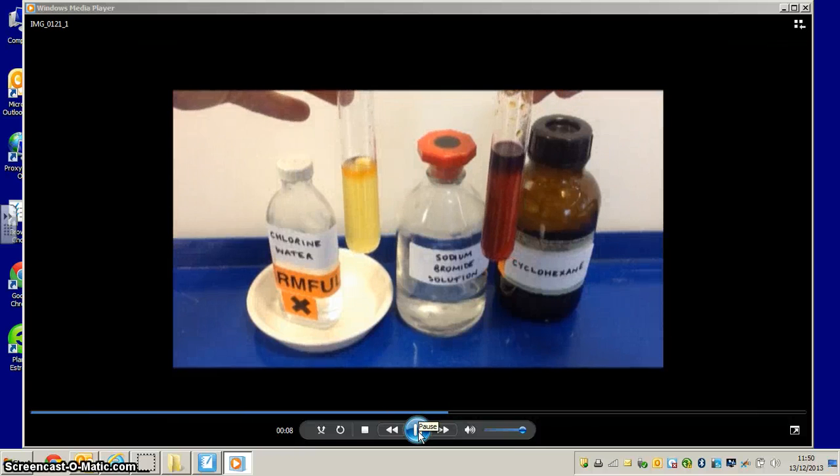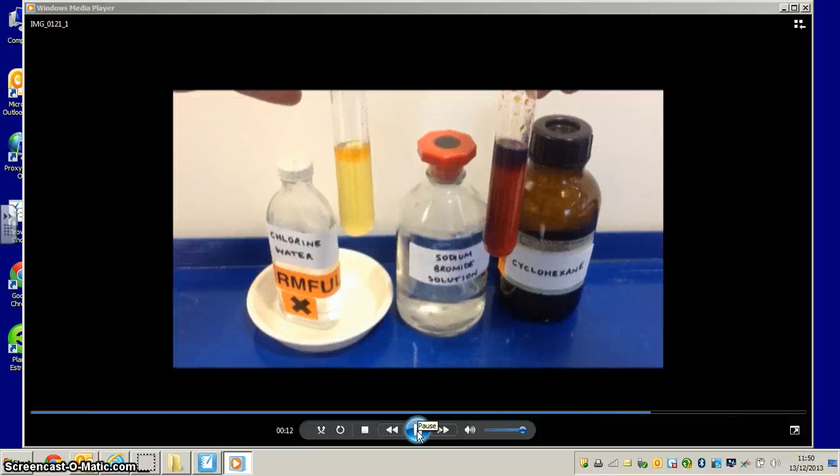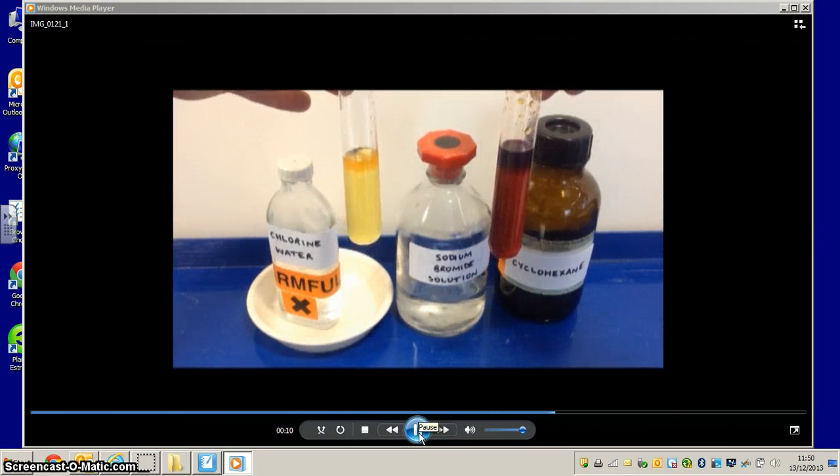So it will come out of the solution at the bottom and form a layer, and you can see that layer on the top. Here we have the layer on the top. So this is the cyclohexane, and the bromine, which was in the solution, has dissolved in the cyclohexane.